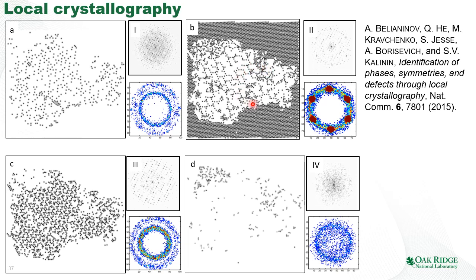This is the second type of atom. You can see that they form the phase M1, and they also form islands inside the phase M2. This is their pair distribution function. This is the corresponding Fourier transform. So you can see that most of these atoms are sitting on the ideal hexagonal lattice. And there is also the amorphous ring, which corresponds to this part of the image. So far, so good. And these are two more clusters.